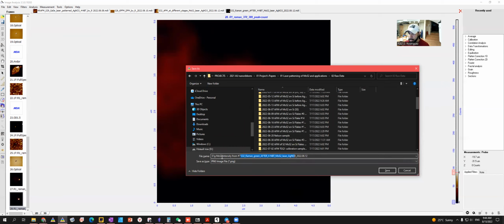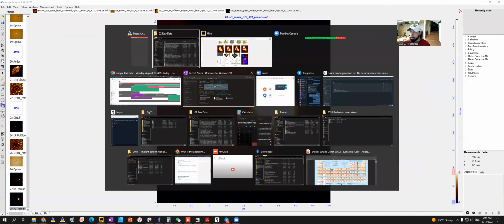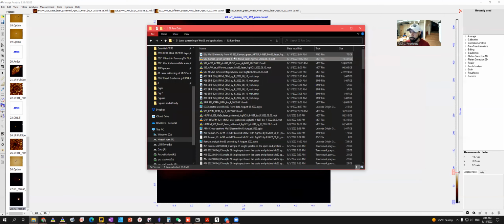So this is important because I need to know where that data is coming from. Once I process it and I need to make any change or to check something else, I need to be able from the file name to find where the original data are. So that's very critical. Once I have that, what is the result from that? You will have this image.